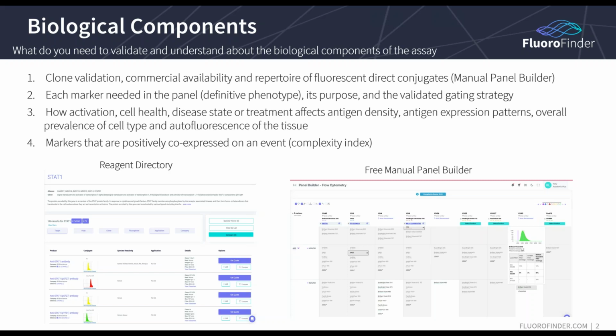It gives you an idea from all the vendors of what fluorophores they're conjugated to, all the isotypes. You can go to their websites, you get the idea. You can sort by all of those features in the middle there: the target, the host, the clone, etc. That lets you know, especially if you have a rare target, that it's in there, that you can include it in a panel, and it gives you more information to explore about that marker.